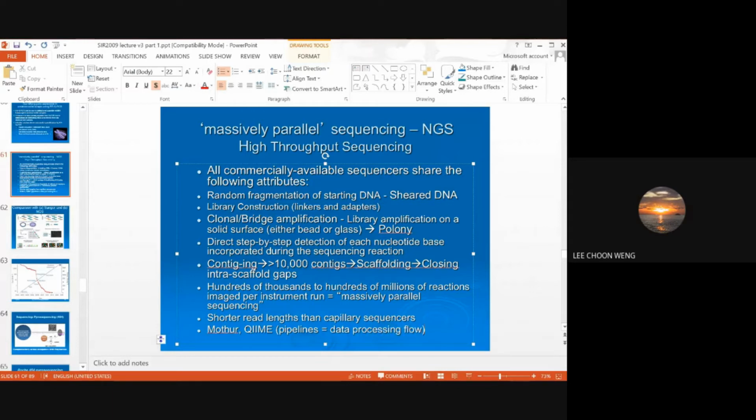They will show you how to process the data, the commands that you need and all that. Even if you're not familiar with programming and scripting, it's not that difficult if you try it out, because it's basically just copying and pasting of the commands, or maybe changing a little bit. Usually you only change the directory or the file name. The rest of the commands are usually the same.